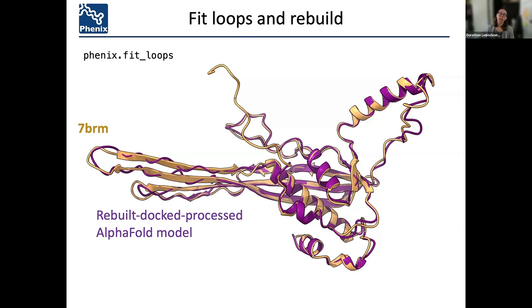Usually, in the scenario where you know what your sample is, you have your map and you have an idea where that particular component should be. So you would look at your map and think about where your model belongs.